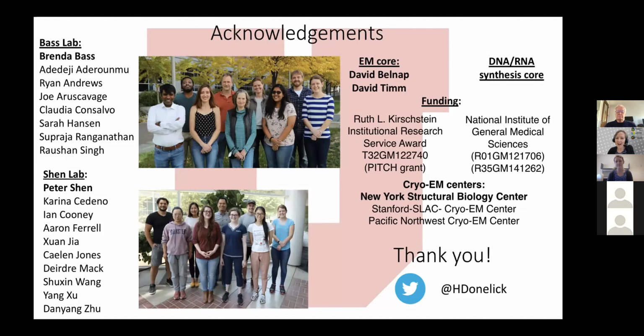Thank you. There's a question about your blotting conditions. What is your reasoning for doing a 20-second wait time before blotting? So that was through multiple trials and error why we chose 20-second blotting. I was using 30 in the past, but then we weren't getting as good of ice quality. And I also went down even to as low as 10. That wasn't ideal as well. 20 is just what we converged on that worked.